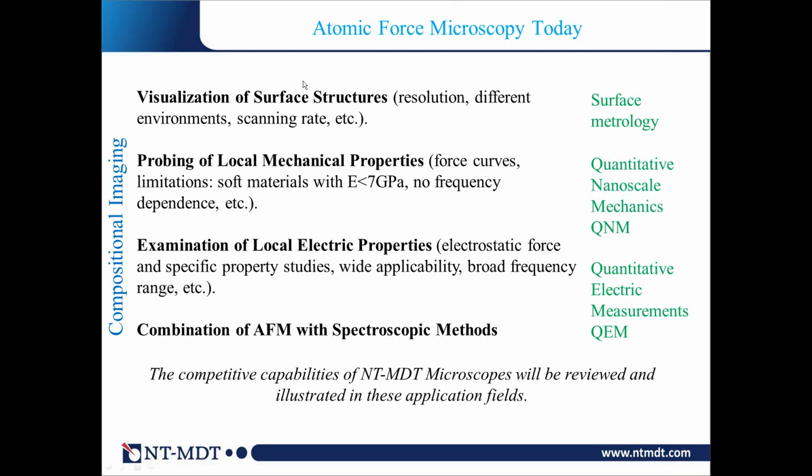And these applications, I just grouped in several fields, which we really will touch on in our presentation. That's including the visualization of surface structures. This is primarily the microscopic function of atomic force microscopy. Then we go to the probing of local mechanical and electric properties, and then even touch the issue of the combination of AFM with spectroscopic modes.